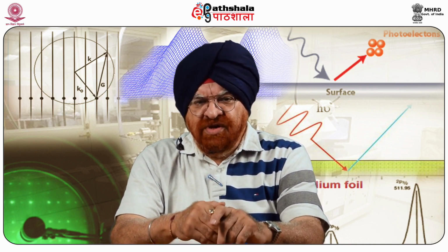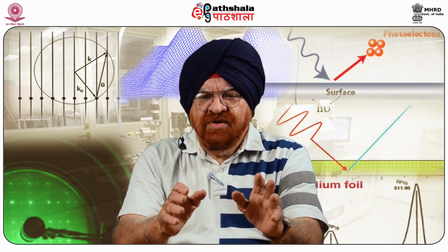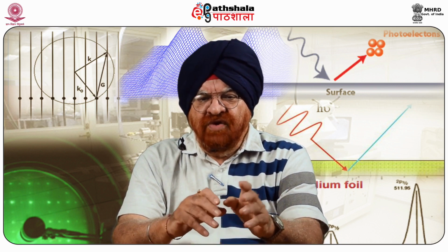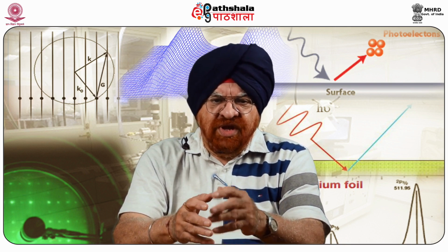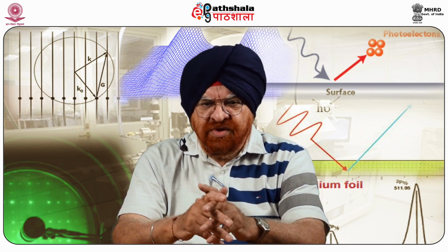Moving further, with the tilting analyzer, one is able to scan the energy of the reflected electrons at any angle, and that can be resolved. Excitations with a momentum parallel to the surface will lead to a variation of the angle of reflected electrons with respect to the elastically scattered electrons.